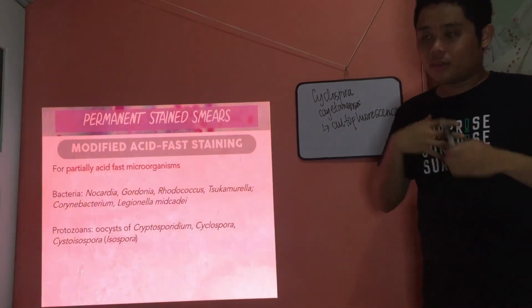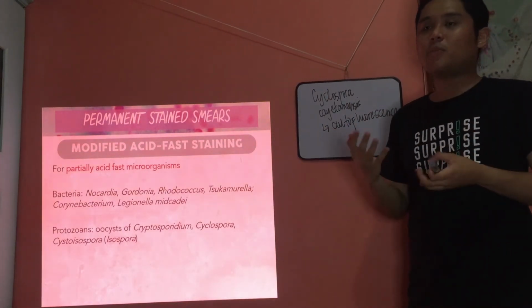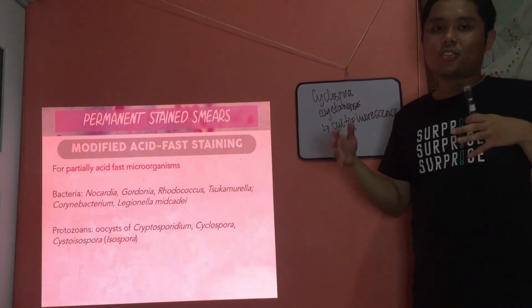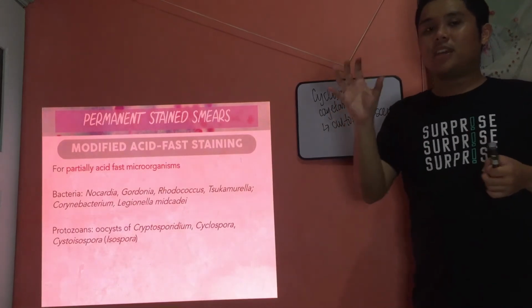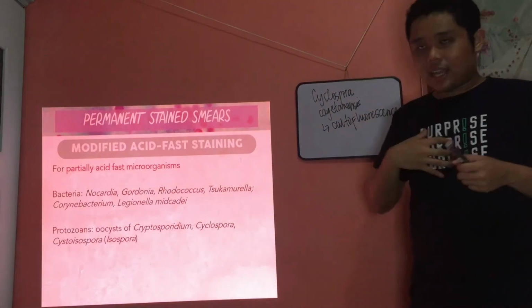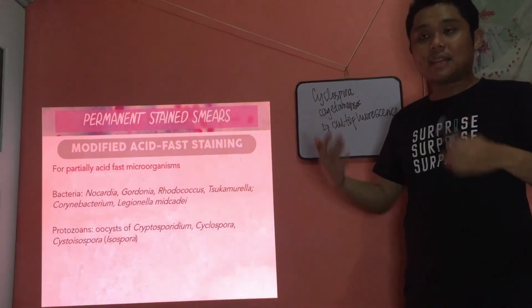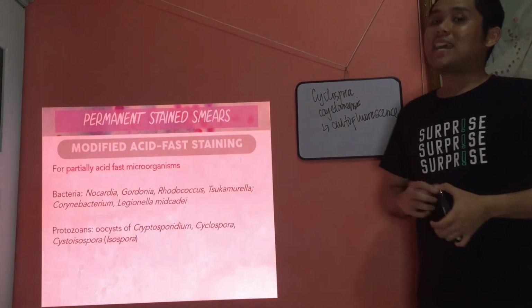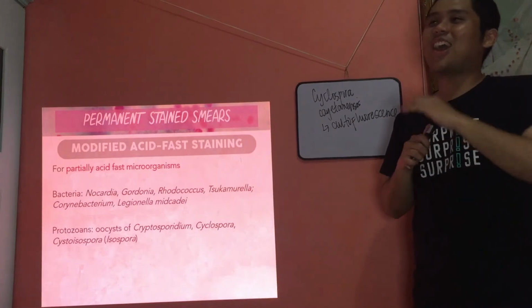In itself, mag-emit siya of light, okay? Even without adding auramine, rhodamine, the stains, even without adding any stains to fluoresce or without giving it energy. In itself, muhatag siya of fluorescence. It emits fluorescence light, okay? Who is that? Autofluorescence? Cyclospora cayetanensis. Please take note. Okay, alright, ayan.